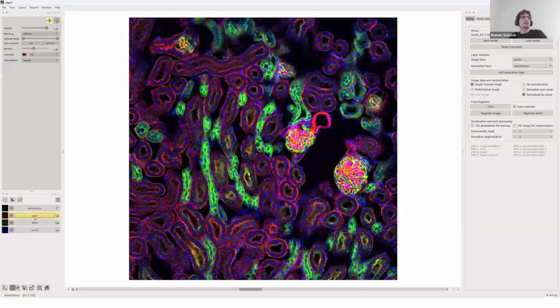So you have one layer for the actin channel, one layer for WGA, and one for nuclei. And Napari knew from the sample image which one to give which color. So we have inherently in the layer, we said display actin as red, display WGA as green, and nuclei as blue. This is also why it's nicely displayed in those three different colors.